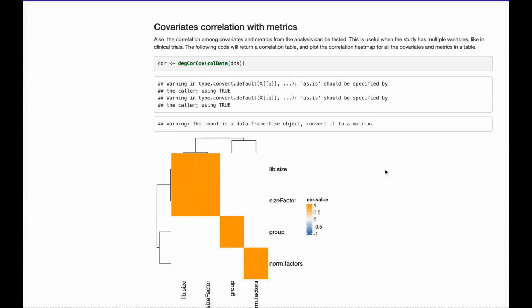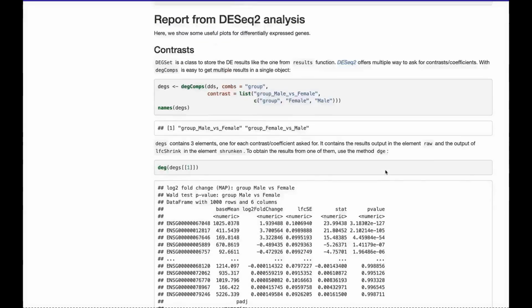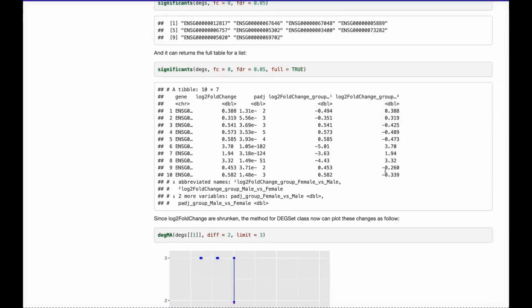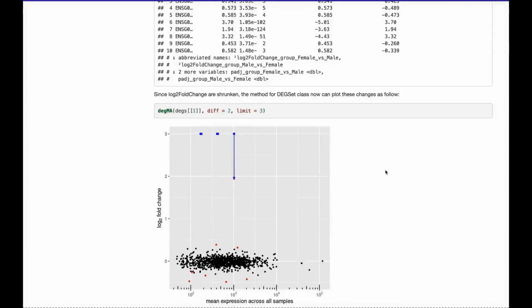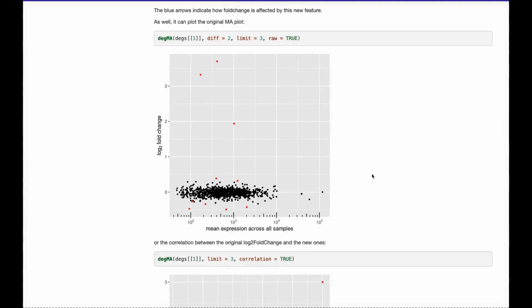This might be important. Then, more generally, it can make a long QC report, well, significantly different genes you find anyway. Then another MA plot in two options, with the blue stripes or without. Okay, we can test it.